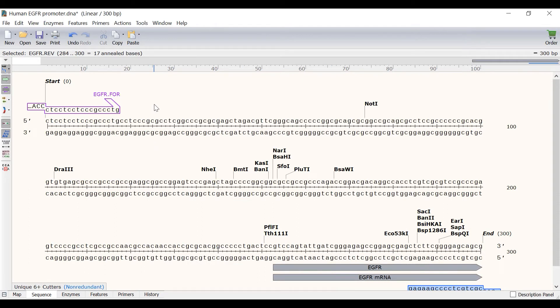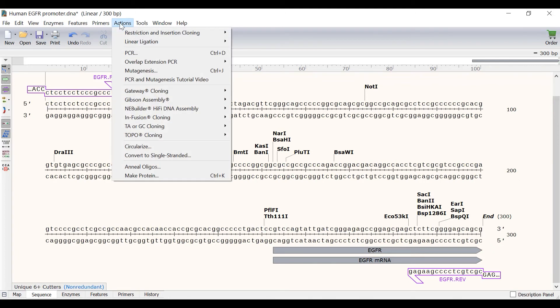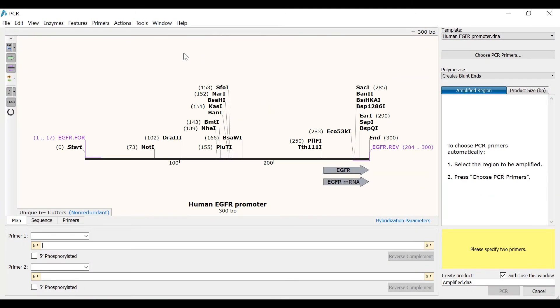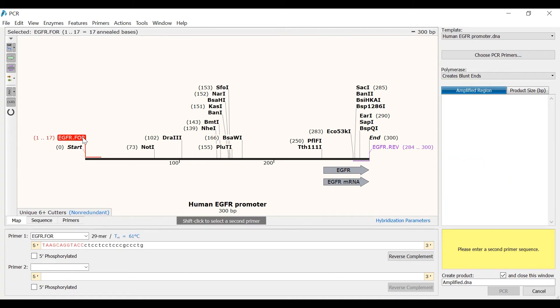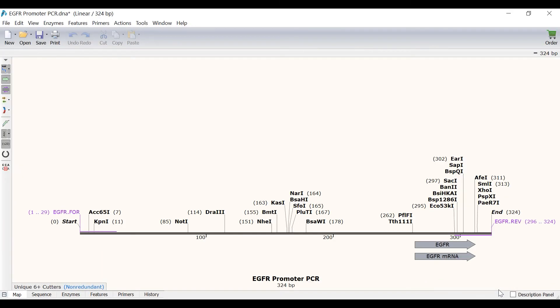Now with the primers designed I can simulate the PCR by going to Actions, PCR. To specify the primers for PCR I can either click on the first primer in the main window and then shift click on the second primer, or I can use the drop down menus at the bottom of the window. With both primers selected I will rename the file EGFR Promoter PCR and click the PCR button to simulate the reaction.